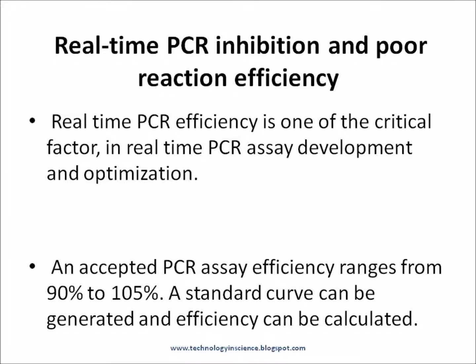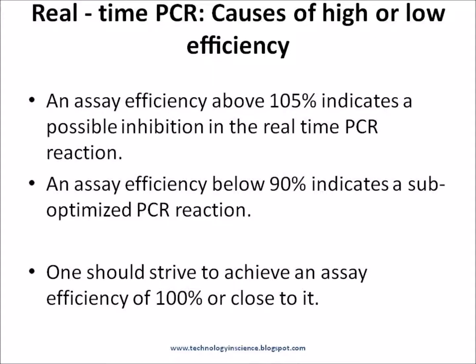An accepted PCR assay efficiency range for real-time PCR is 90% to 105%. An assay efficiency above 105% indicates possible inhibition in the real-time PCR reaction. The main reasons for inhibition are the poor quality of DNA or RNA used as template, use of high template concentration, sub-optimized extraction procedures, and the presence of high amounts of chaotropic salts which can inhibit Taq polymerase activity.